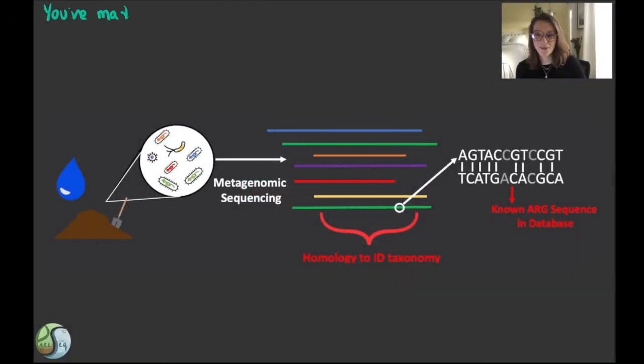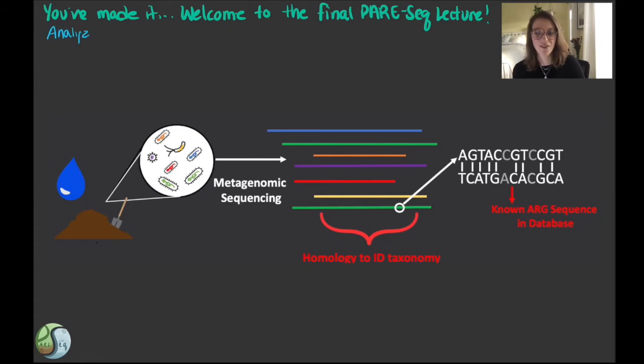Hey folks, welcome to the final lecture video of the PARE-Seq program. We're so excited that you've stuck with us and put up with even me talking to you for this many minutes. But here is where we get to apply what you've been learning in this short course, discovering what antibiotic resistance genes are present in the metagenomic sequence data from your soil or water sample.